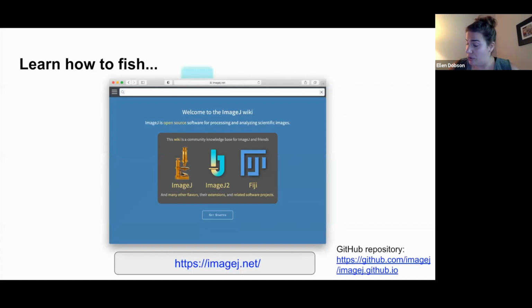It's really the go-to place to learn for beginners as well as more advanced users and developers. This site has actually been very recently updated, and it's now hosted and can be edited via GitHub. We've spent a lot of time curating the information in here, but nothing's perfect. We really lean on the community to edit pages and ask for better content as well. So if you think anything is missing, please reach out to us, and we love to continue to improve this resource for the community.